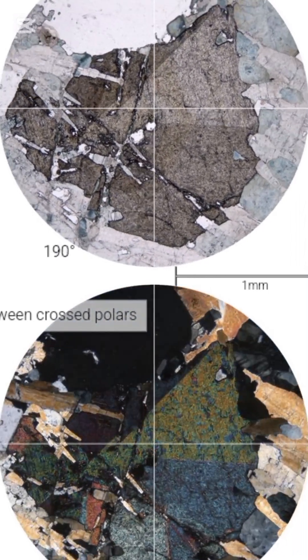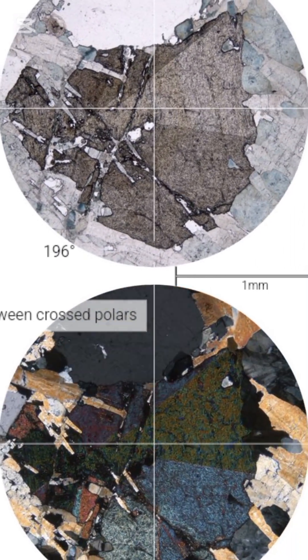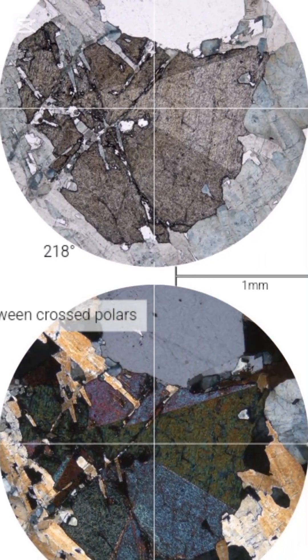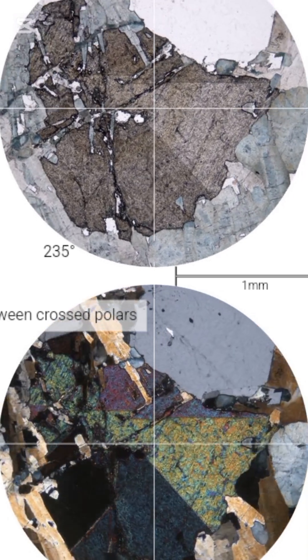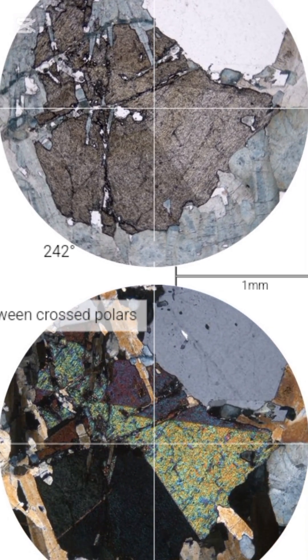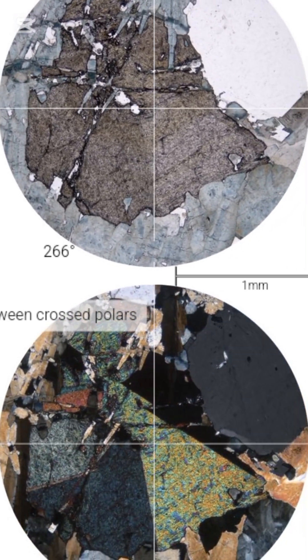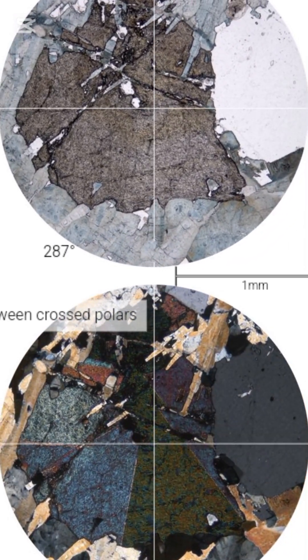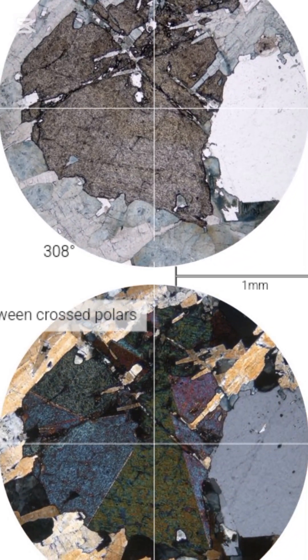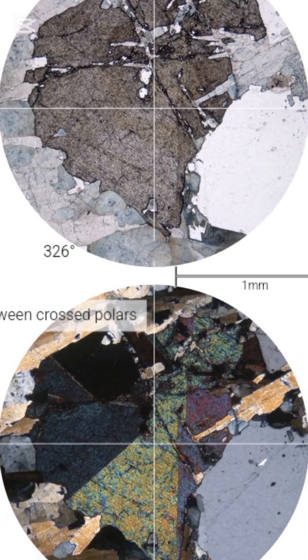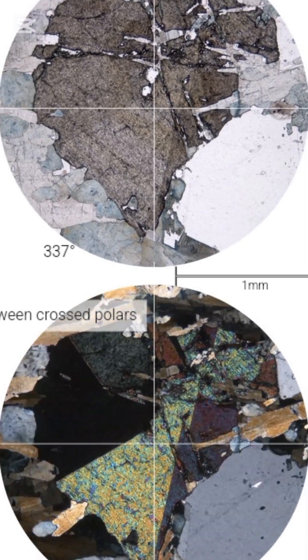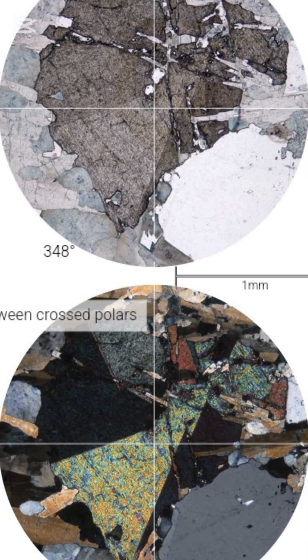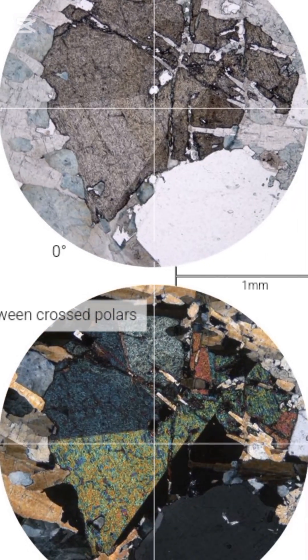The pleochroism changes from blue to brown. Igneous tourmaline is present in the granitic portion of the rock, but the majority of the tourmaline grains are found in the vein. This hydrothermal tourmaline is darker in color, with a blue-brown pleochroism.